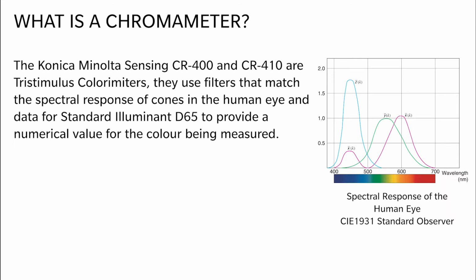So when we talk about colour measurement, ultimately what we are trying to achieve is a numerical value that expresses something that is otherwise very difficult to do. To try and communicate colour without some kind of instrumentation is extremely difficult, if not impossible, certainly not cost or time efficient. When we measure anything, of course, there must be every effort taken to control the variables of any given measurement, and very simply, that is what colour measurement instruments set out to do.